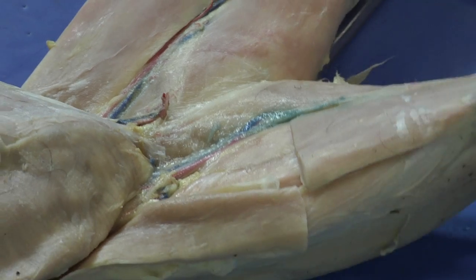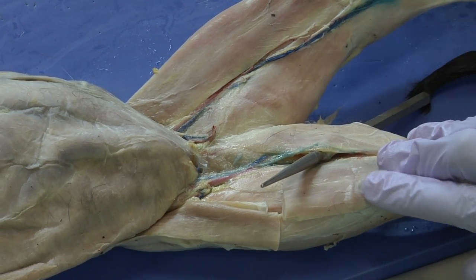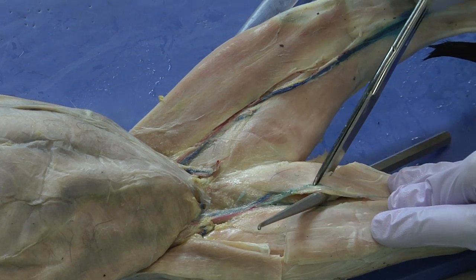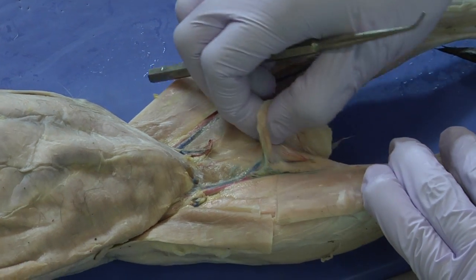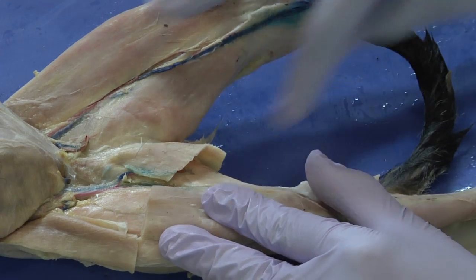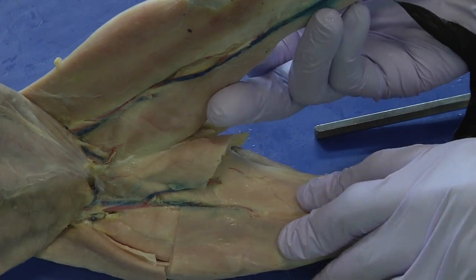And then for the hamstrings, that's going to require a bisection of the gracilis. So again, want to use the probe as the marker, make the cut, reflect the muscle, and reveal. So the hamstrings are made of three primary muscles.